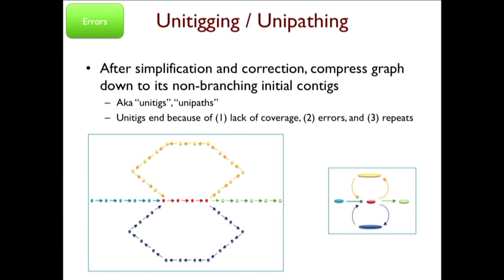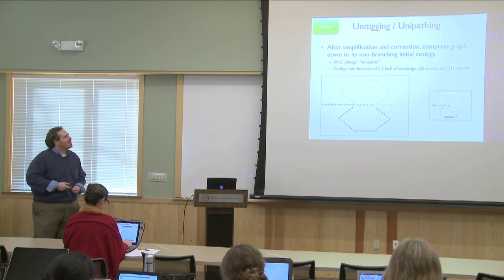One reason is that you just have lack of coverage. Beyond this green segment here, there should be something else, but we just didn't have enough coverage. We just kind of fell off. We've kind of went from wet pavement back to dry pavement. This is actually the best case scenario, because all you have to do is go spend more money, get deeper coverage, add it in there, and we'll be okay.